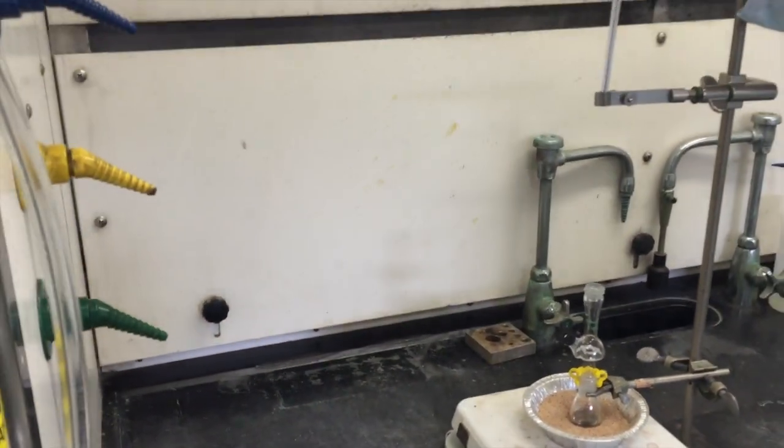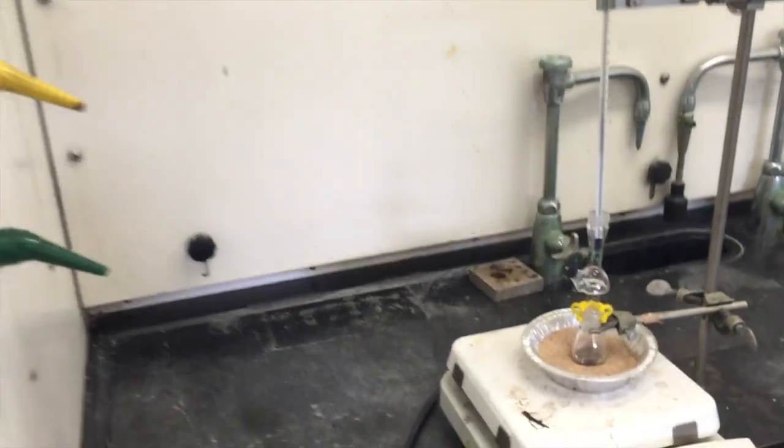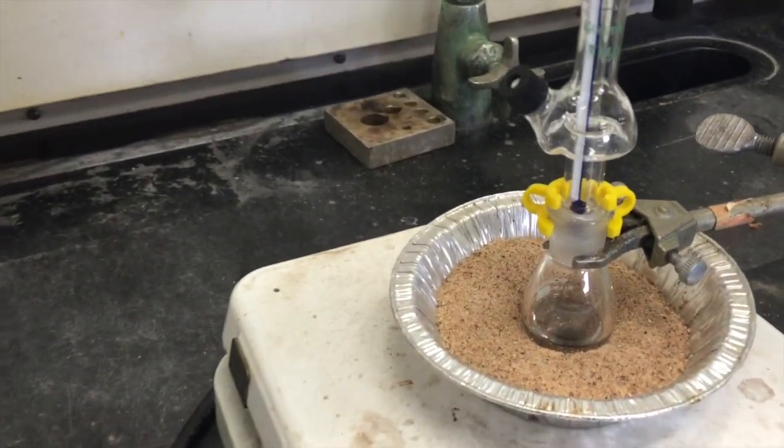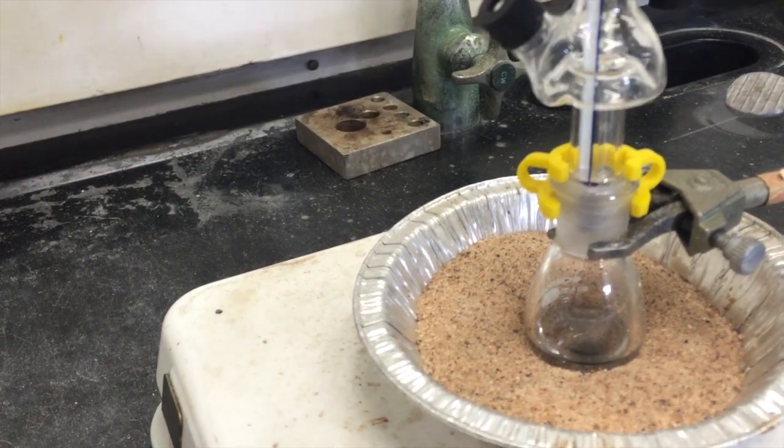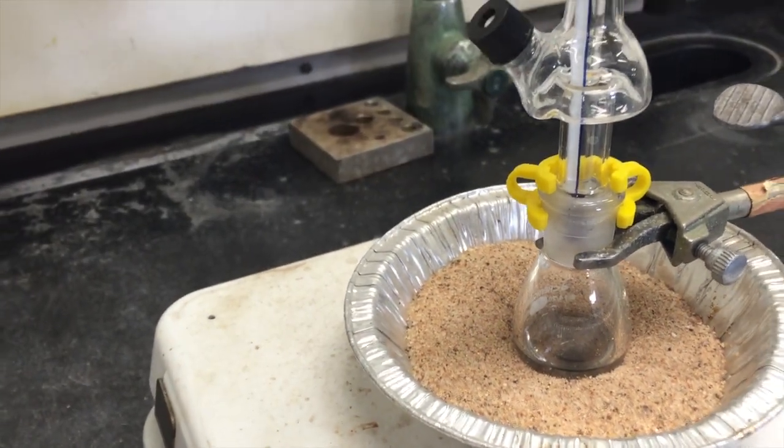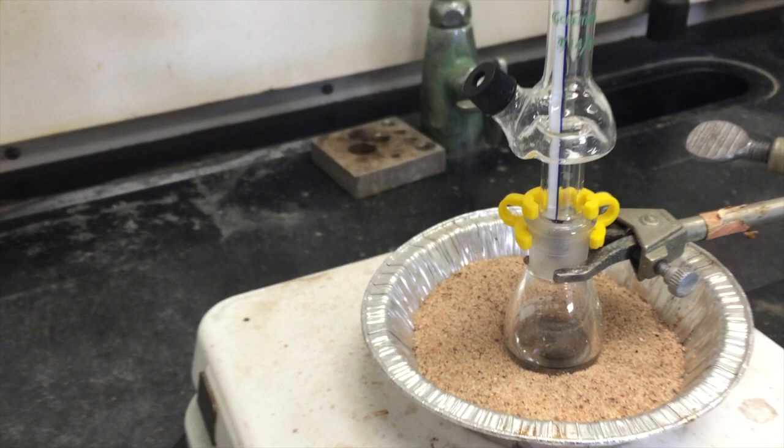Clamp a thermometer to the ring stand and insert it into the Hickman still so that it is not touching the sides of the glass and it is nestled well within the joint to ensure an accurate reading. Solvent will evaporate and condense at the top of the Hickman still and then collect in the lip.